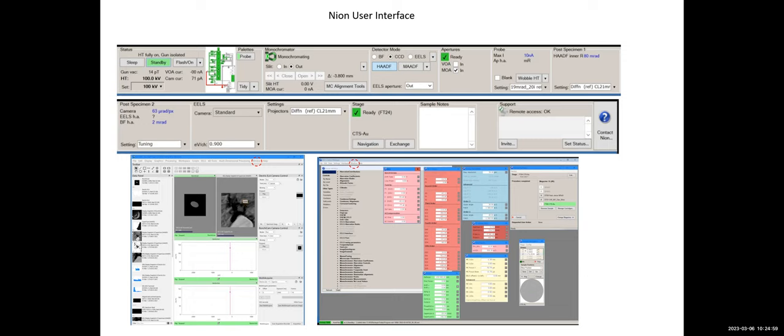If you want to measure phonon, you want to choose 1 millielectron volt per channel. If you want to measure some band gap information, you want to choose maybe 0.01 eV, which means 10 millielectron volt per channel. If you want to do some good resolution colors, maybe 0.2, 0.3. And if you want to do a mapping covering a lot of elements, you maybe go to 0.9 or 1.5, yeah, depending on your need.